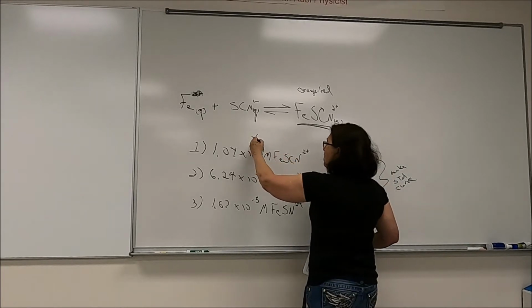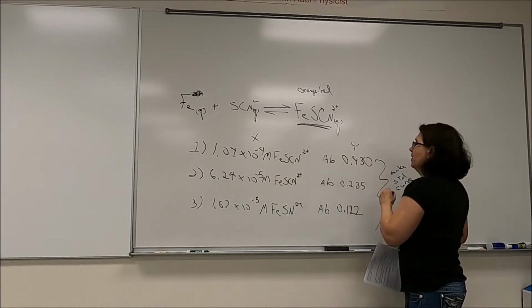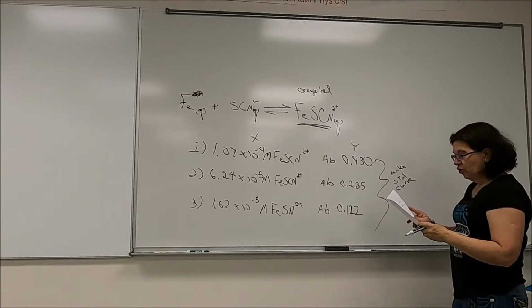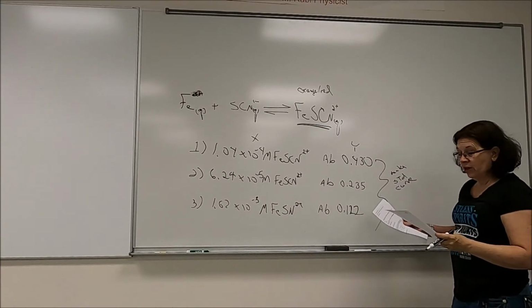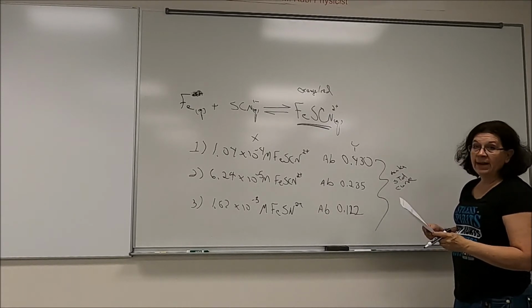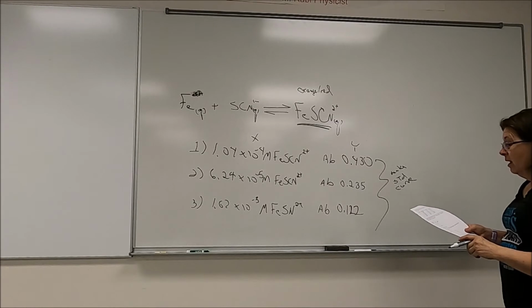Your concentration is your X value, your absorbance is your Y value. Okay? And I want you to do your graph, include your graph with your lab, and give me the equation for the line. Okay?